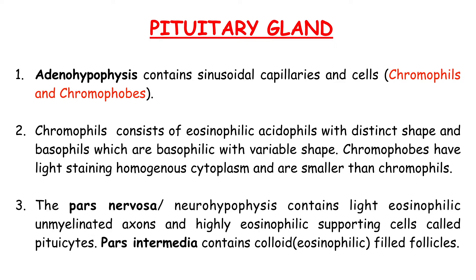The pars nervosa or neurohypophysis contains light eosinophilic unmyelinated axons and highly eosinophilic supporting cells called pituitocytes. Pars intermedia contains colloid eosinophilic filled follicles.